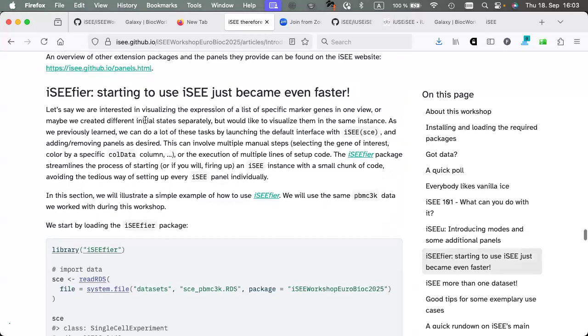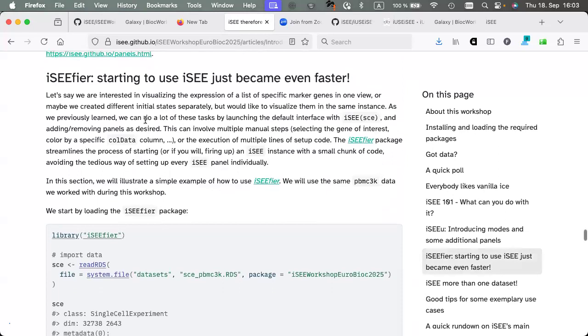And then there is one tiny little creature that came to life last year. It was, let's say, playing to the extreme with the fact that we needed to get lazy and efficient, to help our collaborators. We are working a lot with immunologists, whom we love a lot, and they would like to play a little bit more with lots of markers. And then, for example, starting with a configuration that just throws them into the middle of how the data looks.